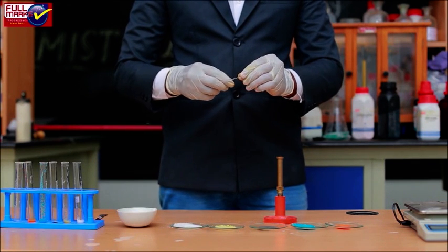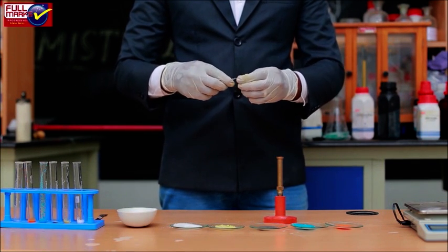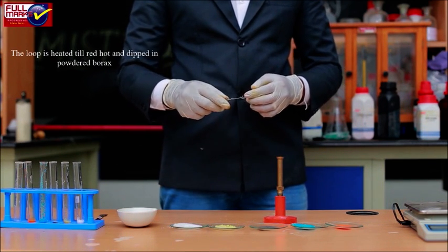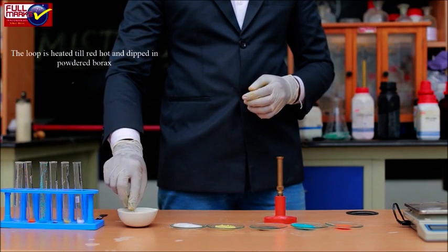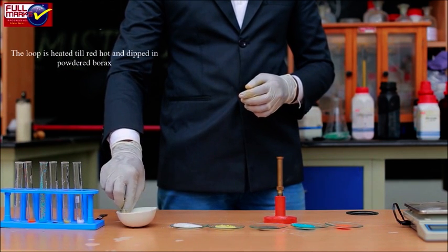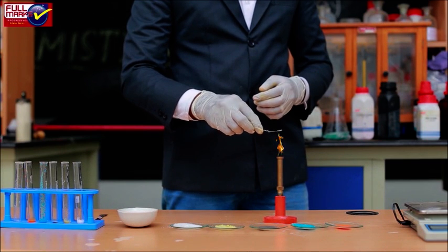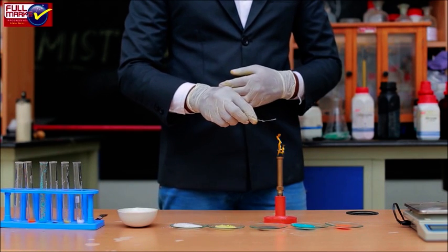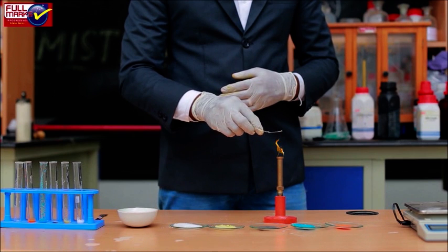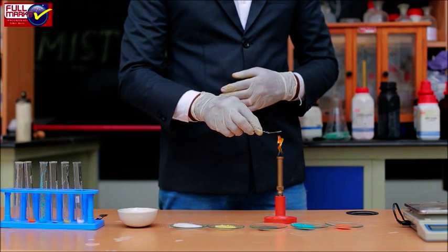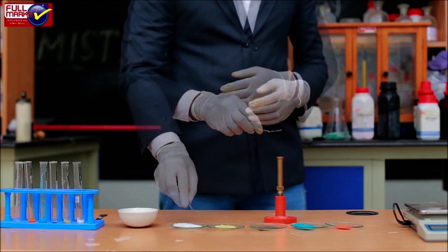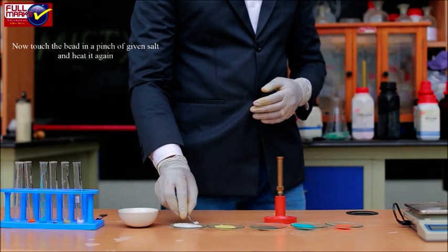Borax bead test procedure: A loop is made with platinum wire. The loop is heated till red hot and dipped in powdered borax and heated again. The borax swells up and gives a transparent bead. Repeat the process till you get a perfectly colorless bead. Now touch the bead to a pinch of given salt.